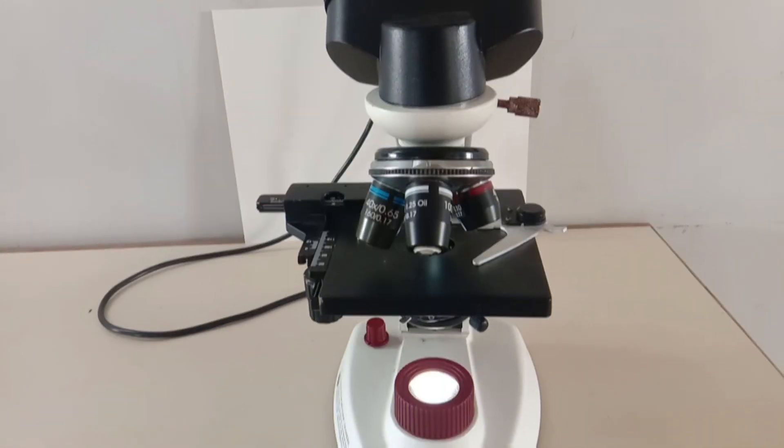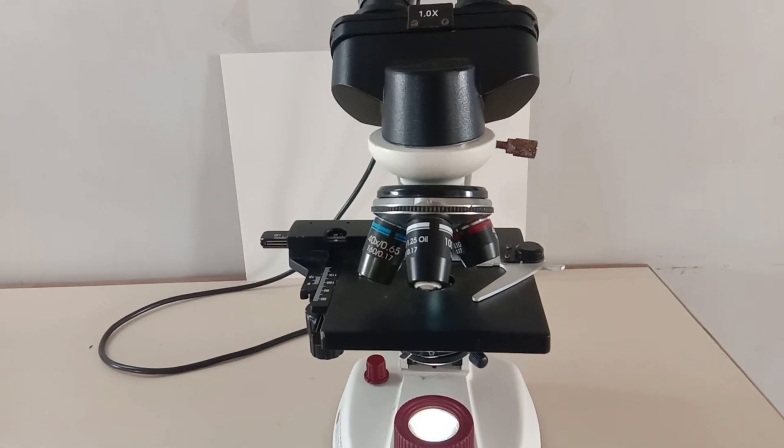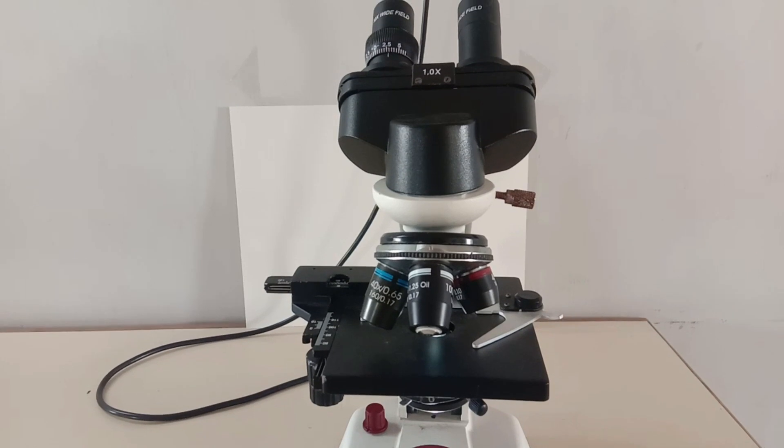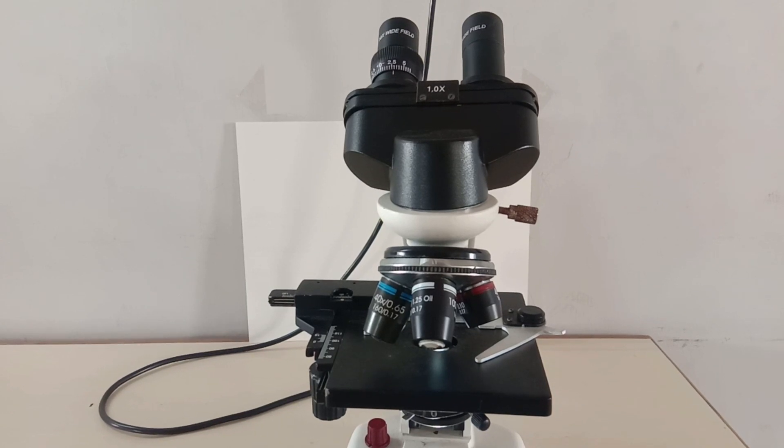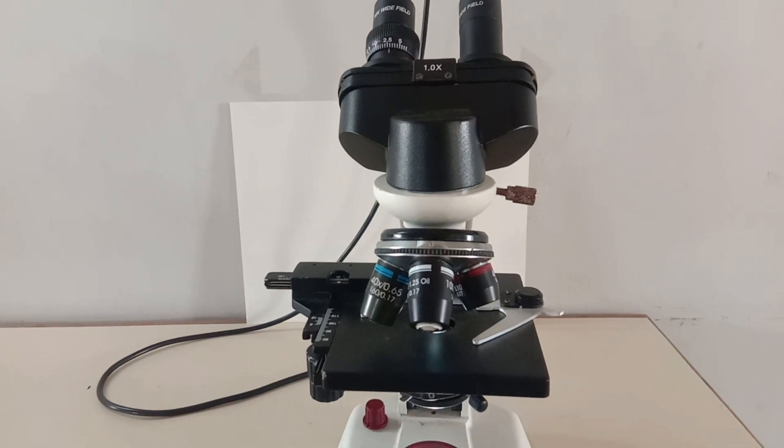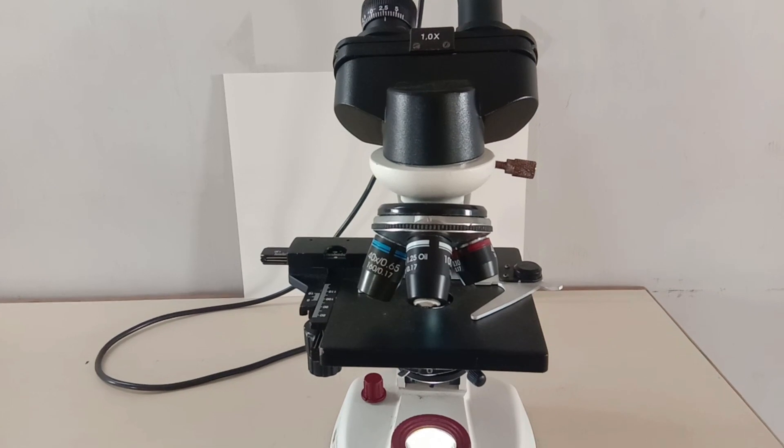Hello scientific audience, today I am going to show you the Spirella bacteria under the compound microscope. For this demonstration we will require a permanent slide having Spirella bacteria and the compound microscope. This compound microscope has multiple lens system.